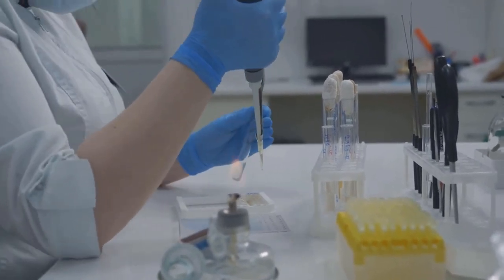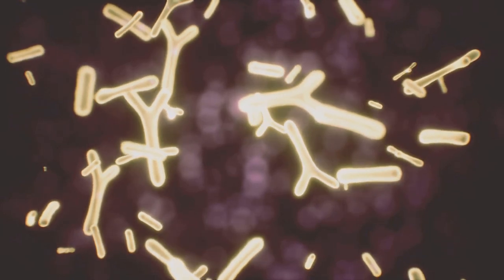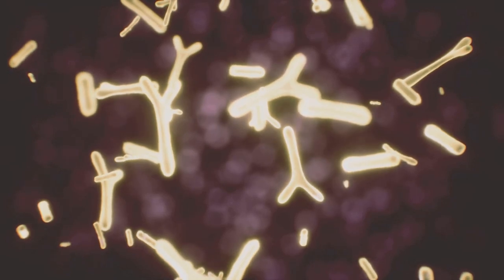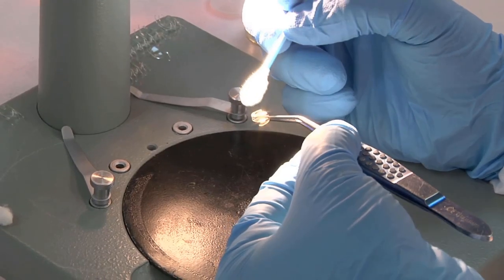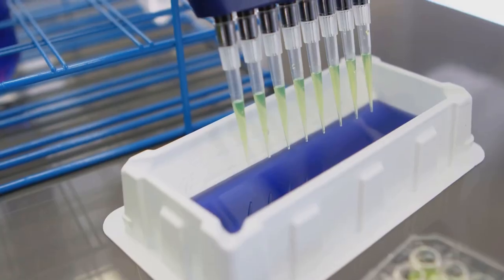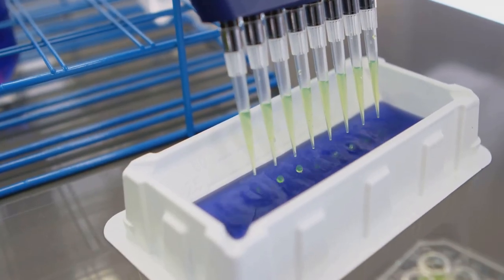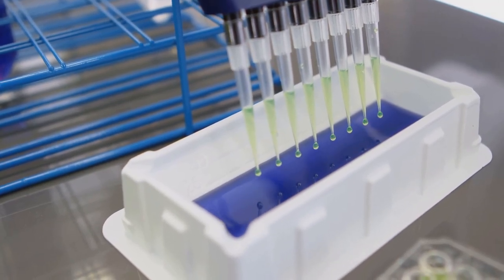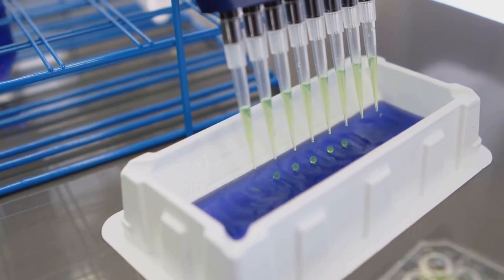Mixing in microfluidics is like trying to stir your soup with a toothpick inside a thimble. It's a delicate, slow process. But scientists are clever. They design the channels like tiny water slides, adding twists, turns, and bumps to make sure the liquids swirl together. It's like inviting your friends to a dance party, but instead of just standing around, you've rigged the floor to make everyone bump into each other until they're finally mixed up.